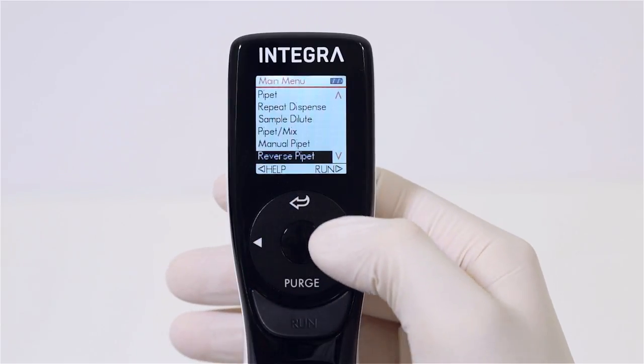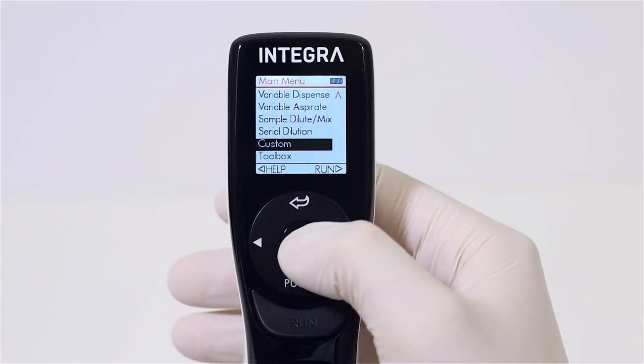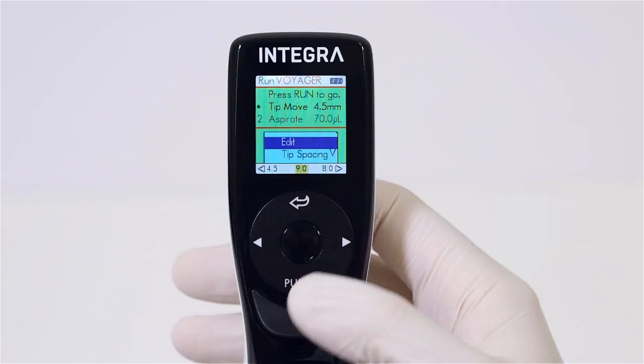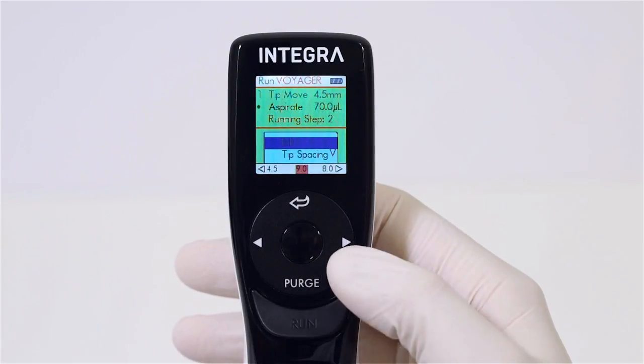In addition to the standard preset programs, up to 40 customized programs can be created. The tip spacing can be part of the custom program, so you can change it simply by the touch of a button.